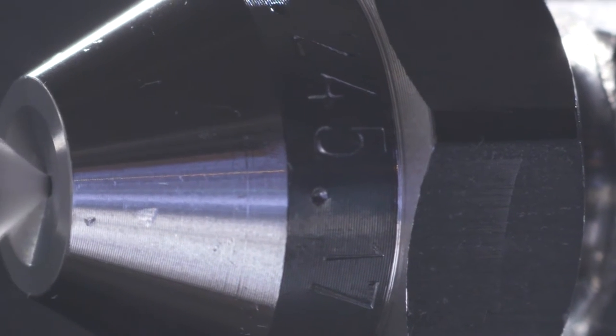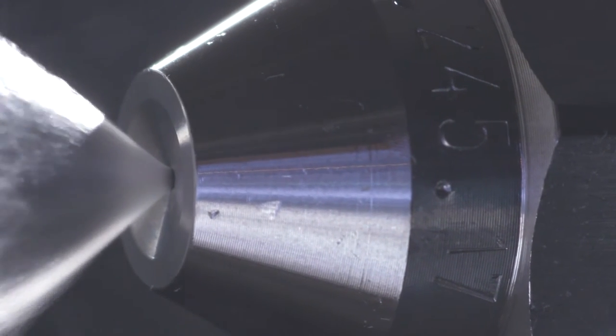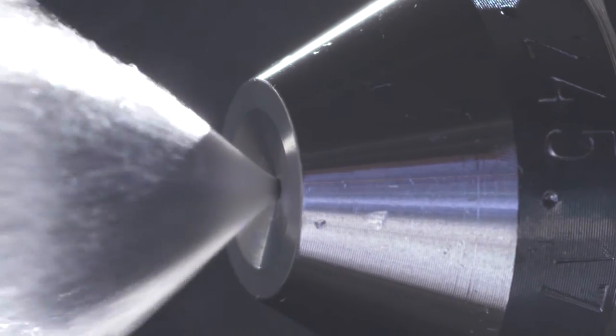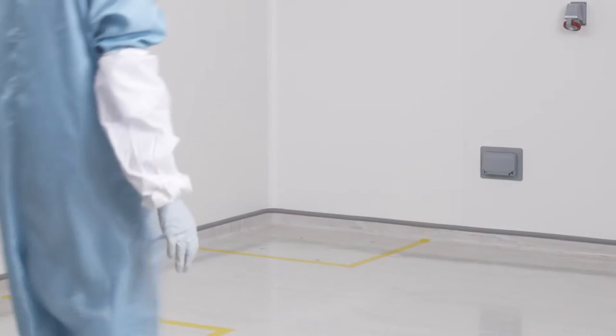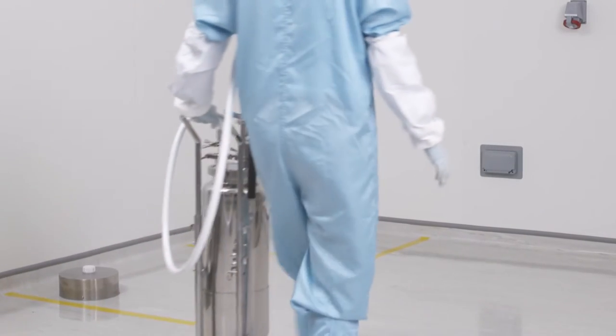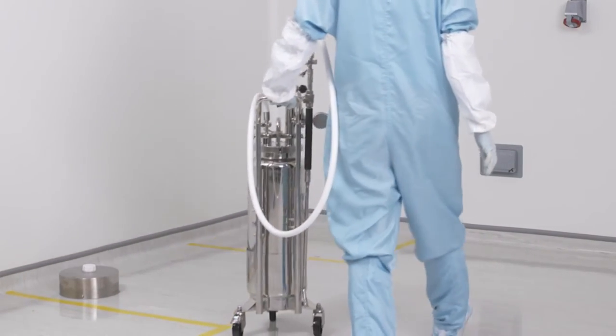In addition to rapid fluid application without runoff and versatile spray options, the Clear Side Pressurized Spray System is designed to offer users the ability to easily access any part of a clean room. Firstly, it's designed with a narrow footprint, so it rolls easily into narrow spaces behind machinery and enables easy access to all surfaces.